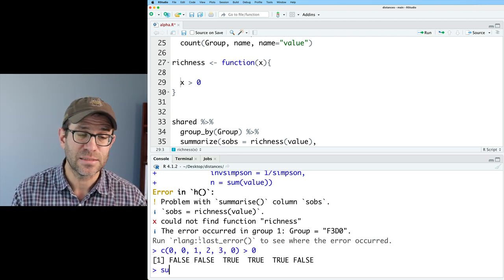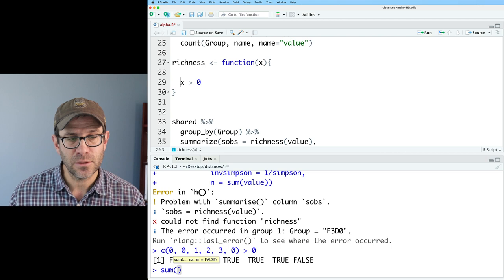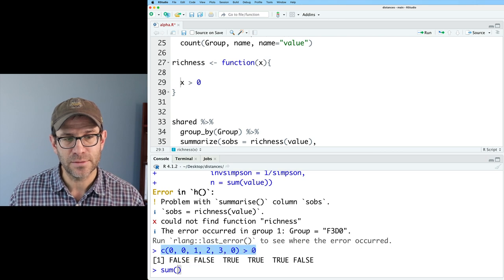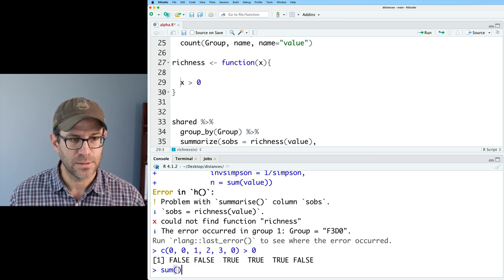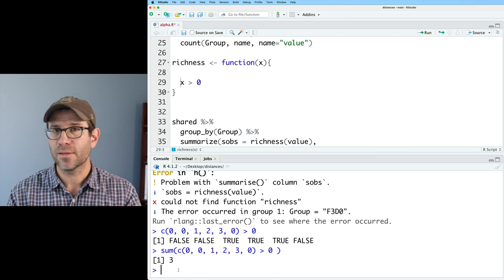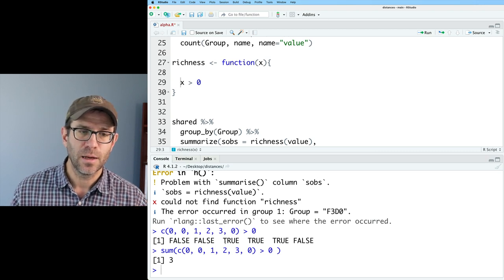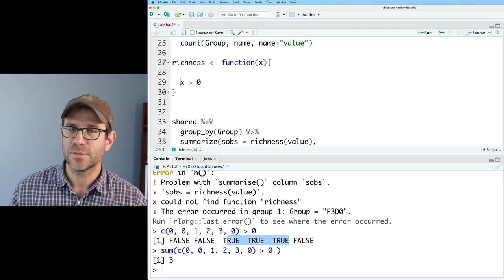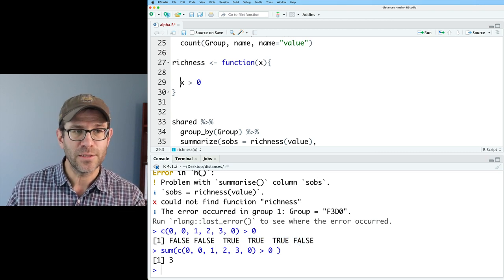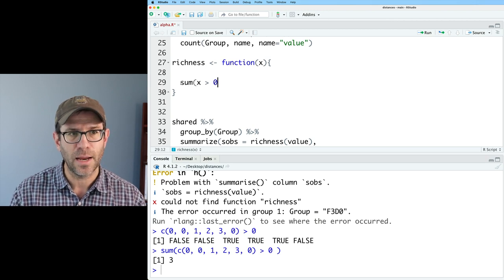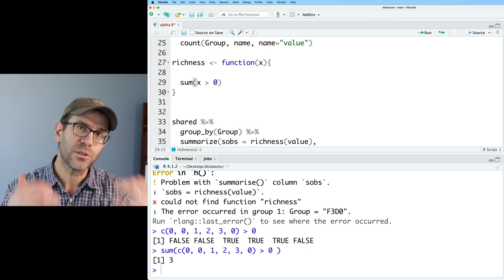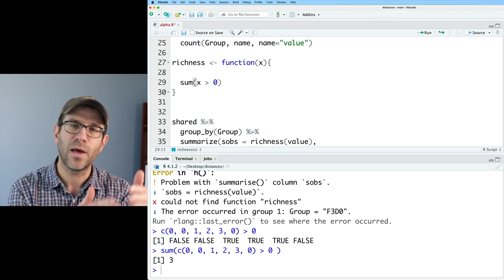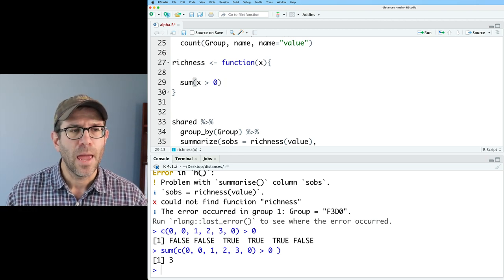Now, if I take the sum function and insert inside of it, this logic statement, I will then get back number three, which tells me the number of times something was true. So if I do that here, if I do sum on x greater than zero, this will return the number of values of x that are greater than zero.